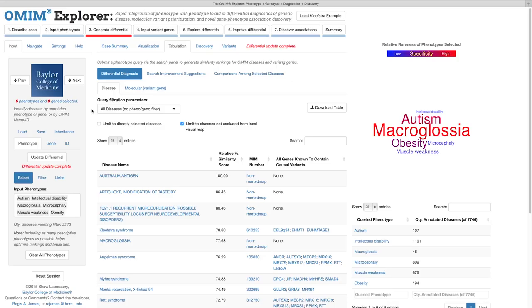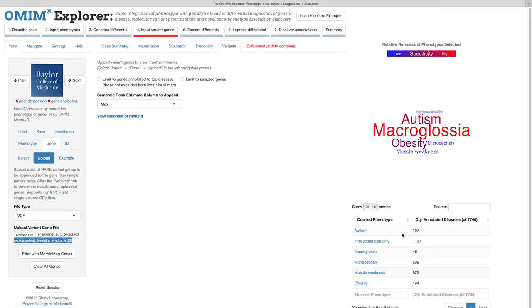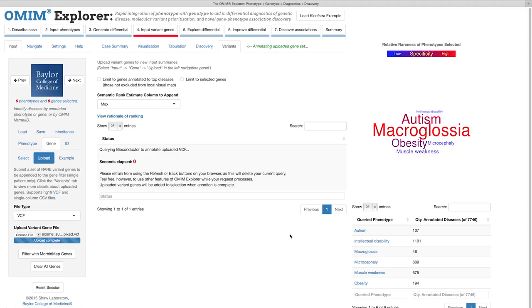Let's advance to the next step. Step 4. Input Variant Genes. By directly clicking the Next Steps button. OMIM Explorer currently supports single-individual HG19 VCFs or single-column CSV text files listing genes of interest. I'll go ahead and upload the VCF for our test case. OMIM Explorer can limit the disease differential to diseases causally linked through OMIM's morbid map to variants in the uploaded VCF.